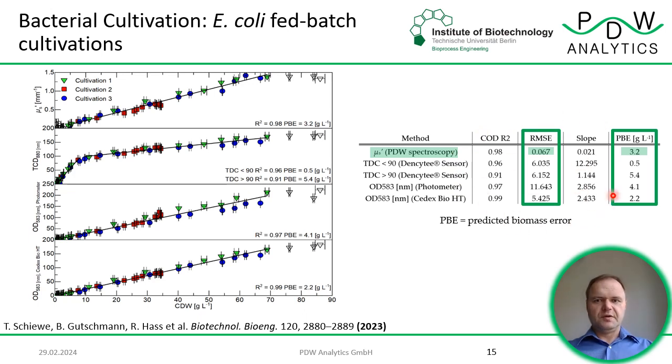If one looks a bit more into values here, we find that for inline measurements, especially at high concentrations, the PDW spectroscopy gives the best predicted biomass error towards high concentrations.